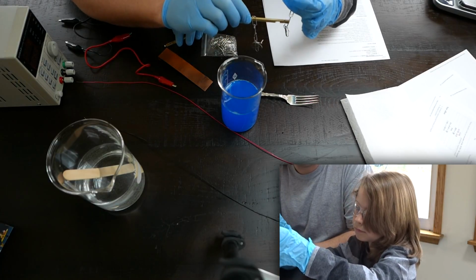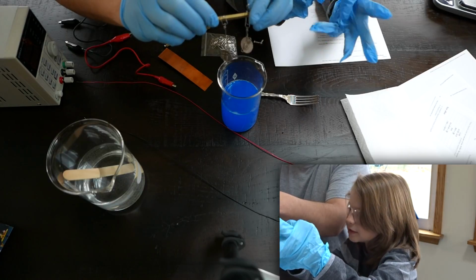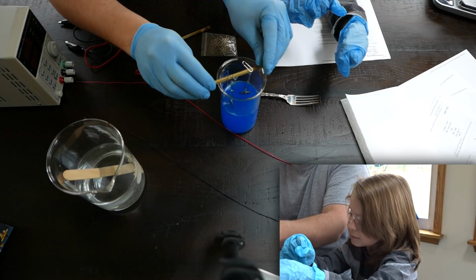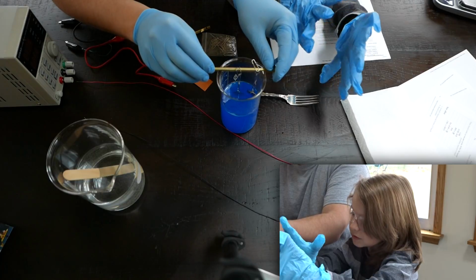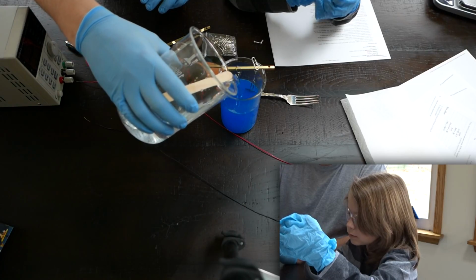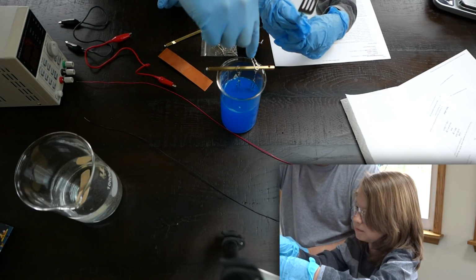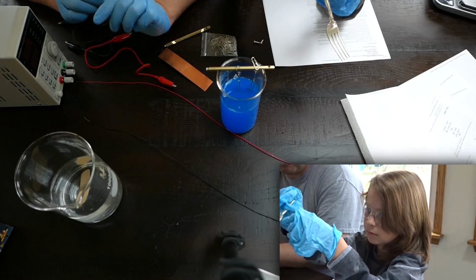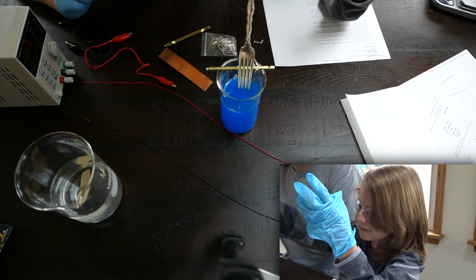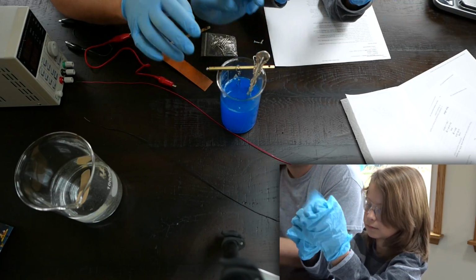See how this one's hanging on here? Alright, there you go. In there. And we're gonna dump those in there just like that. We're gonna just put a little bit of water in there just to cover them. Okay. And you want to put the fork in there too? Just stick it in there and lean it against the brass rod. I must have pulled off my glove. Very good. Okay, so that should be metal against metal, right? You're good with the glove?